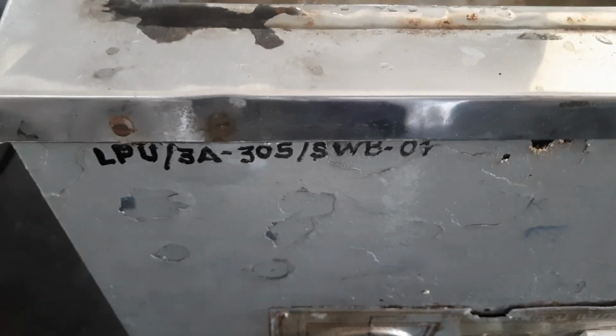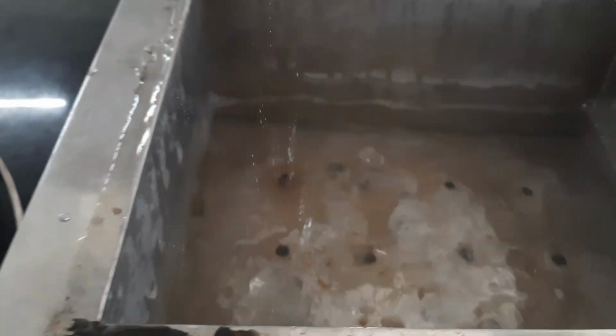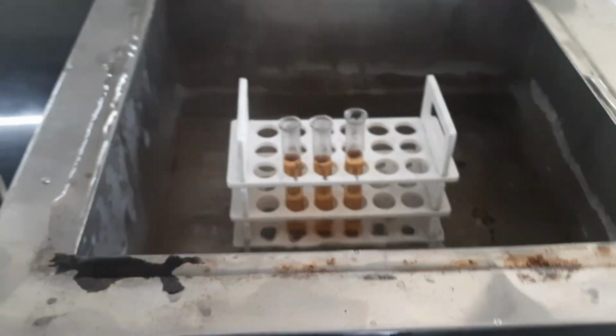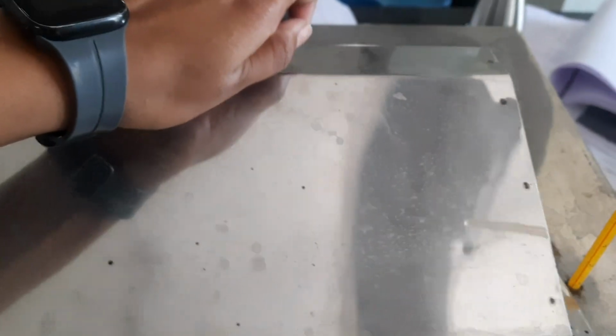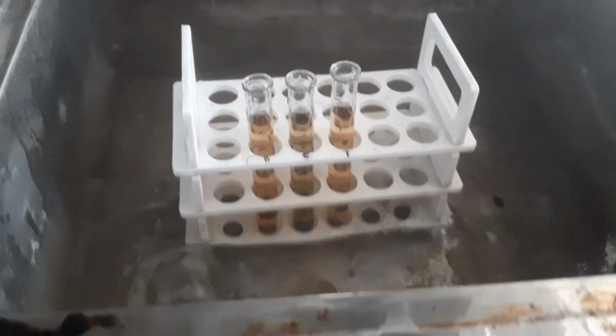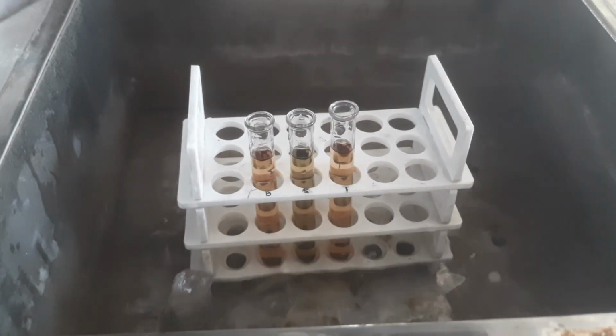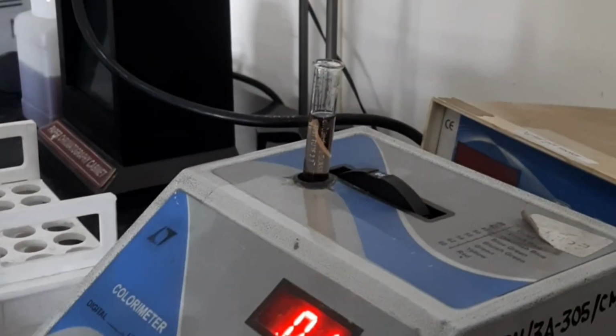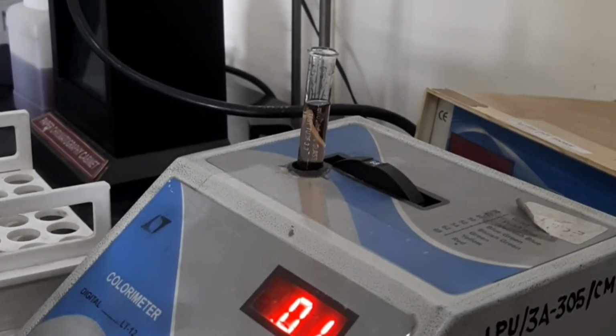So, as far as the procedure has gone, now we will be taking the test tubes and putting them into the water bath at 100 degrees Celsius for 10 minutes. After 10 minutes, we will take our test tubes out of the water bath and allow them to cool. After cooling, we will be measuring the optical density of each of the test tubes one by one, first blank, then standard and then test.